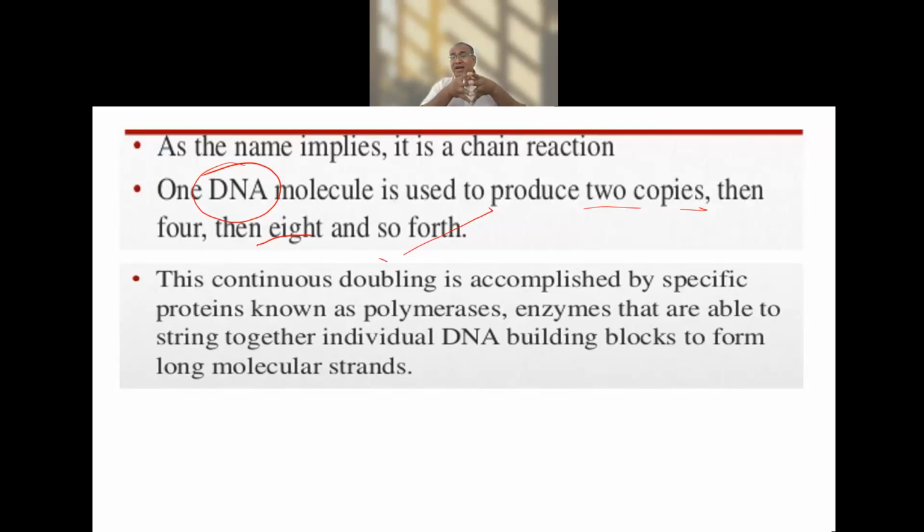When you use this polymerase enzyme, it will allow the sequence, as I told you, of the two strands here. The polymerase here, the probe is going to be synthesized. Another probe I have got. The probe comes and attaches with the reporter sequence and the quencher sequence here.